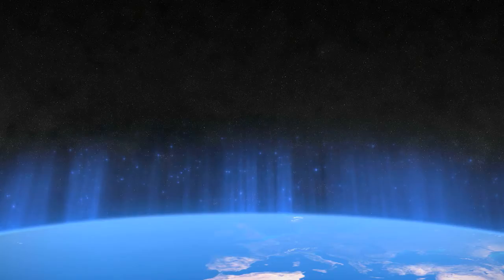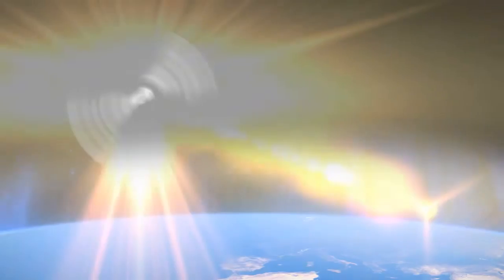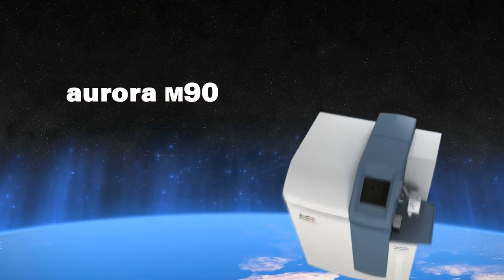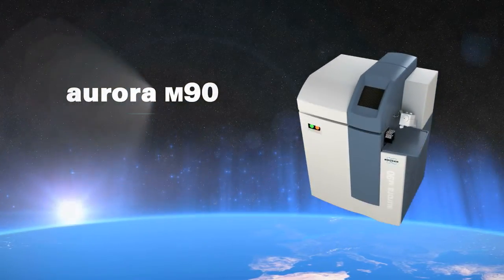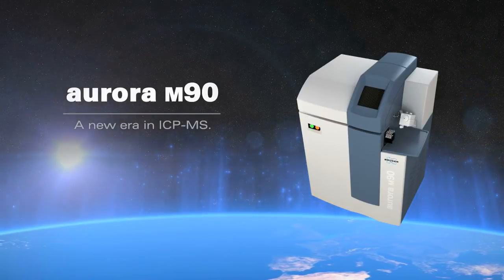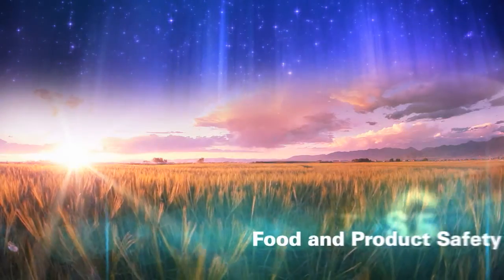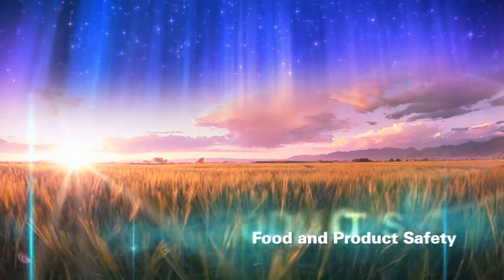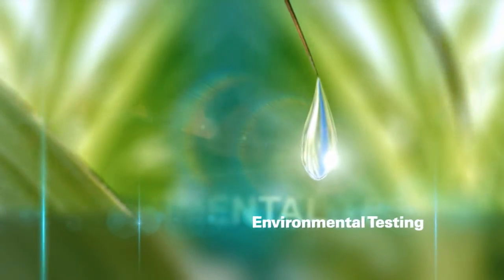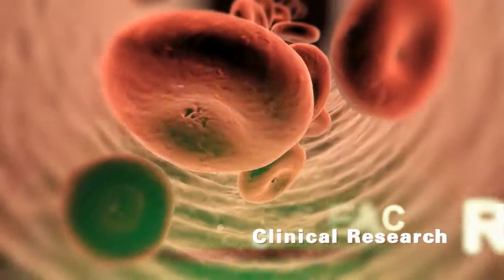The dawn of a new era in ICP-MS has arrived. Bruker introduces the Aurora M90 ICP-MS, a state-of-the-art high-performance elemental analyzer that pushes the limits of detection even further. The Aurora M90 ICP-MS sets new standards for a wide range of applications in food and product safety, environmental testing, industrial application, and clinical research.